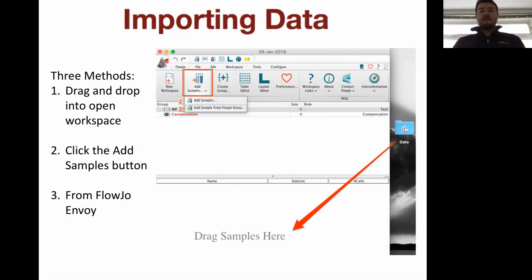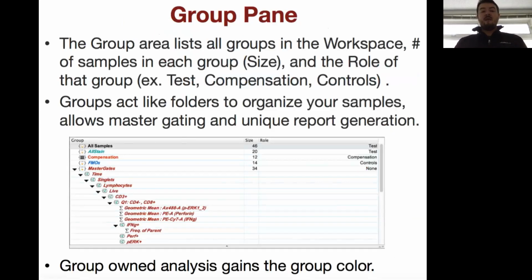So those are the 3 methods of importing data. Next, we're going to talk about another really important area of the workspace, which is the groups pane.